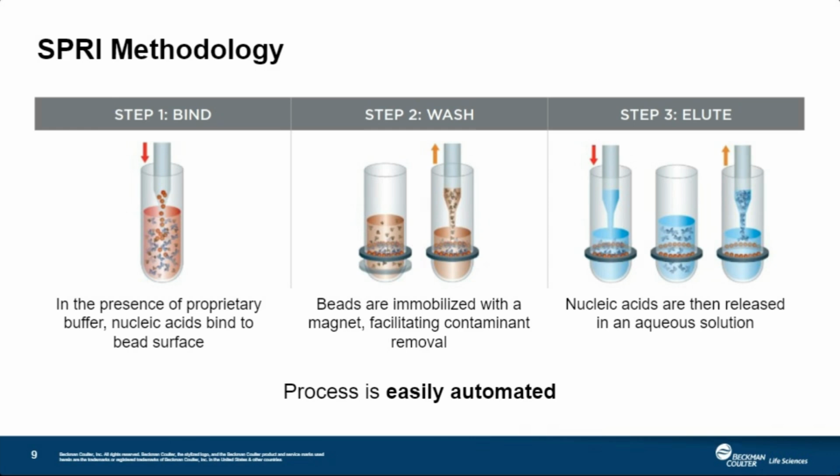The beads are still immobilized on the side, so they're still attracted to that magnet. So at this stage, it's really easy to just simply pipette away your nucleic acid or your sample of interest. And again, this process is easily automated.